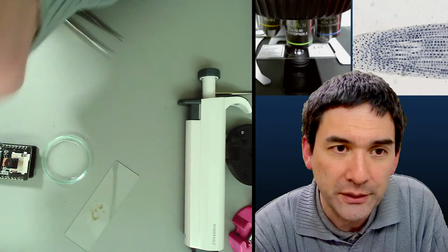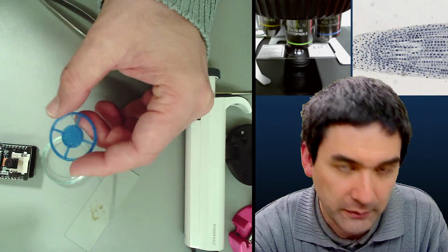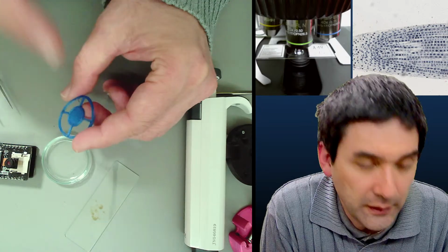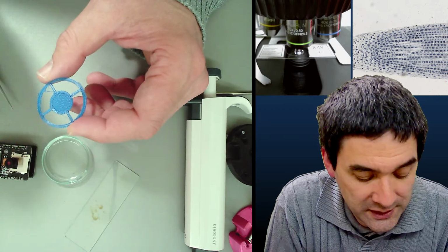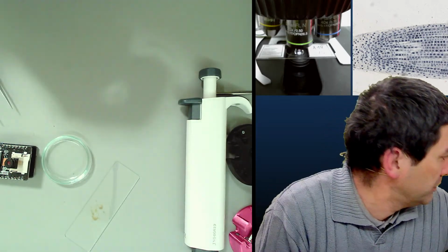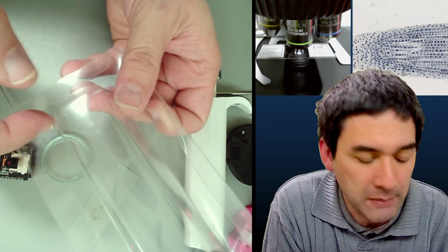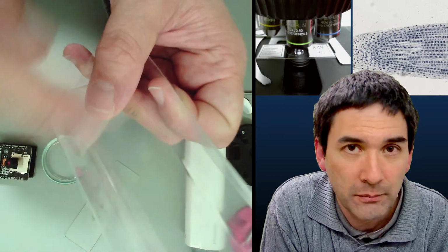Now, I did a lot of 3D printing because it's easy for me to do that, easier than doing this by hand. But what you can do is the following. Do it first with a dark cardboard, and then later on, what I highly advise, because sometimes the black background is a little bit too high in contrast, is to cut out some overhead foil or some kind of plastic foil. Here is one, some plastic packaging material. That's why I kept those. And then you use some nail polish, some blue or whatever.